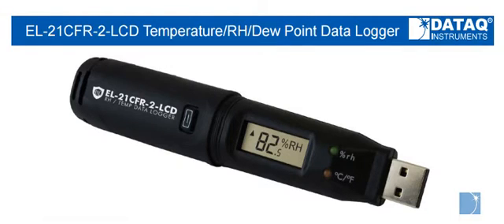The EL21CFR-2-LCD is a stand-alone data logger capable of acquiring ambient air temperature from minus 31 to 176 degrees Fahrenheit and relative humidity from 0 to 100 percent.